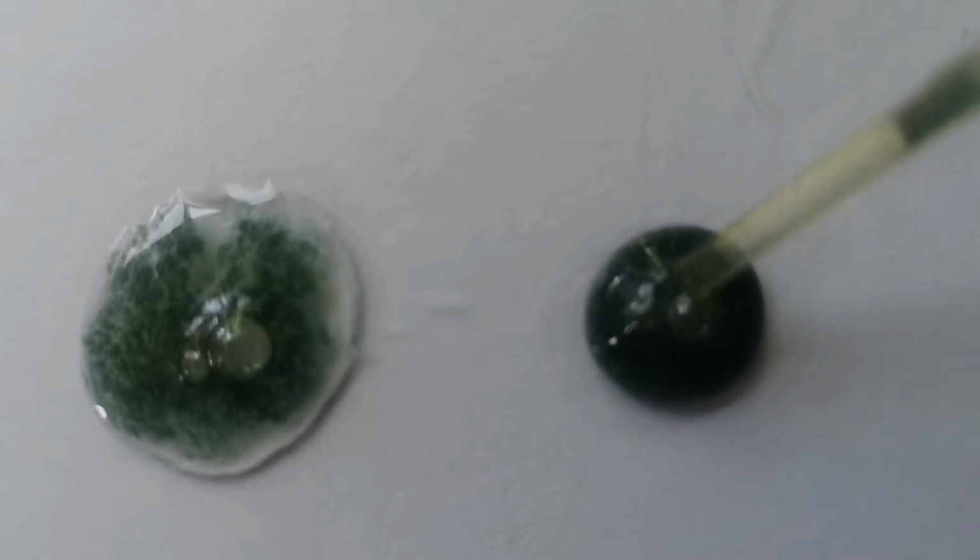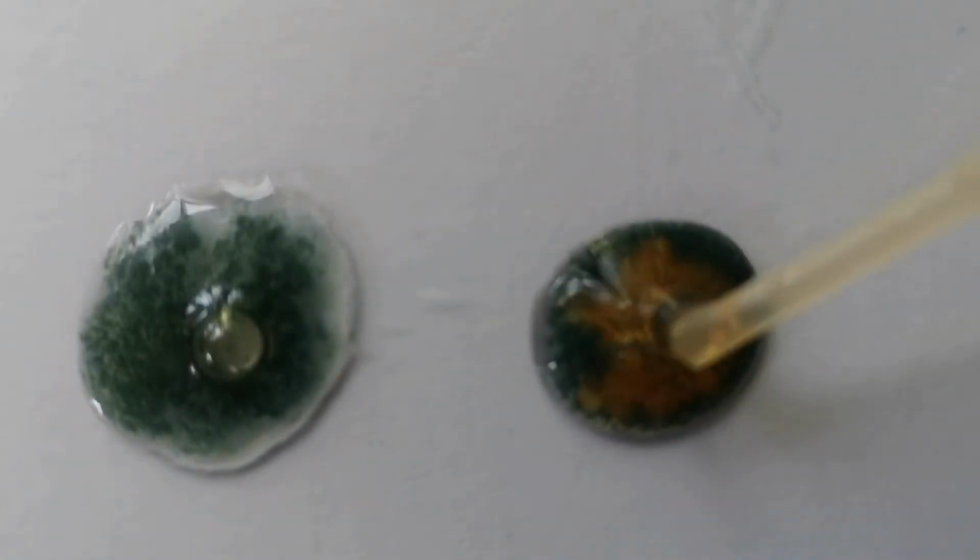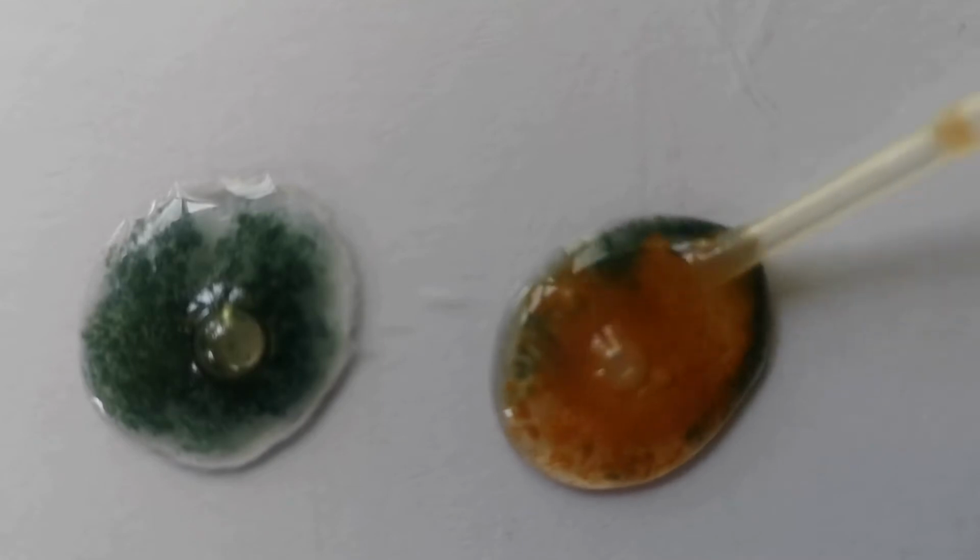If you oxidise this by adding a small amount of hydrogen peroxide, you will see that it immediately turns the orangish colour of iron 3 hydroxide. This yellow-orange colour is typical of iron 3 compounds.